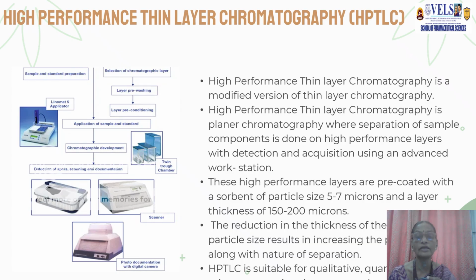High performance thin layer chromatography is a modified version of the thin layer chromatography technique. Here the sample can be applied by using automated, semi-automated, or manual injector application. Then the development is also done in the chamber. Nowadays, modern techniques are also used.